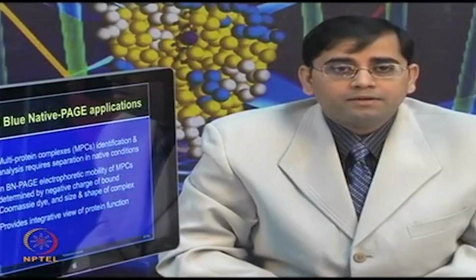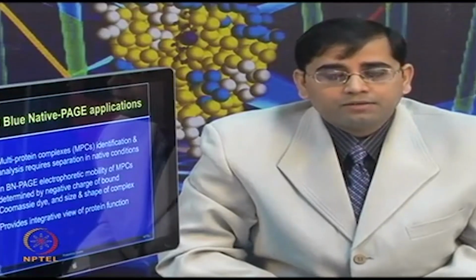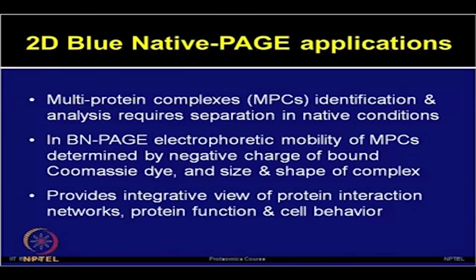People apply the 2D blue native PAGE for various applications, such as studying the multi-protein complexes or MPCs. So, identification of multi-protein complexes is not possible by using the SDS PAGE or denaturing environment.